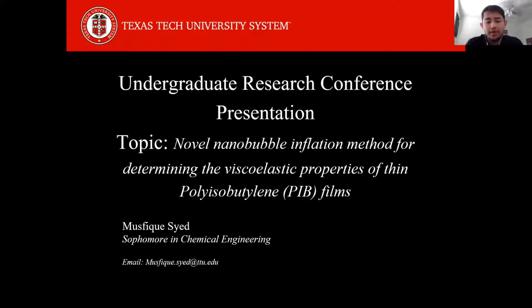The topic for my research is the novel nanobubble inflation method for determining the viscoelastic properties of thin polyisobutylene. I've always been interested in research, and I was lucky enough to have the opportunity to research with Dr. McKenna in our chemical engineering department. The lab primarily focuses on polymer science.